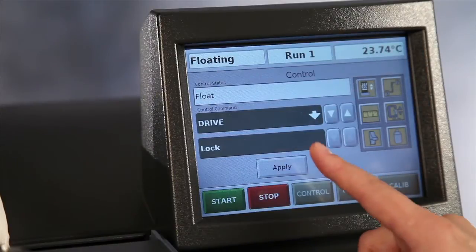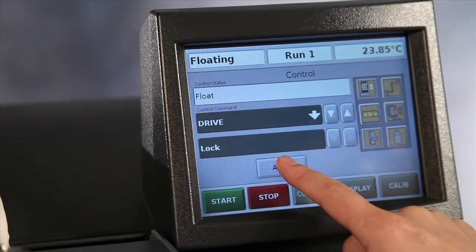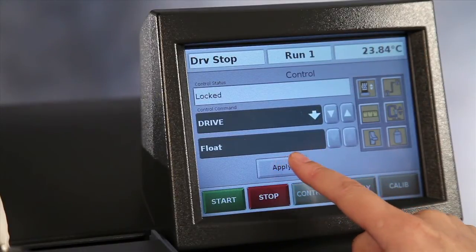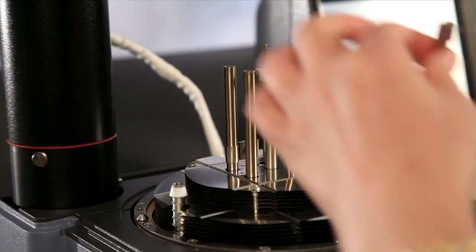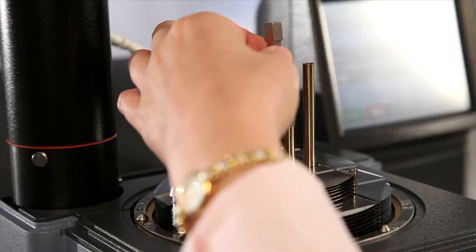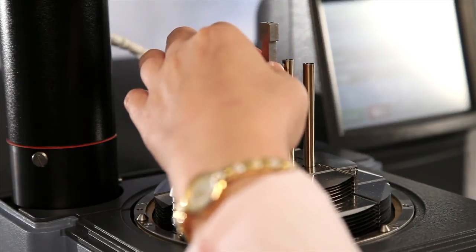From the touch screen, lock the drive shaft. Install the movable clamp to the drive shaft.